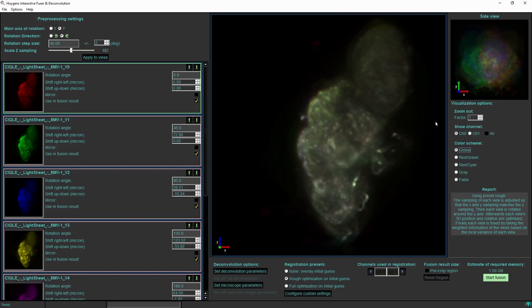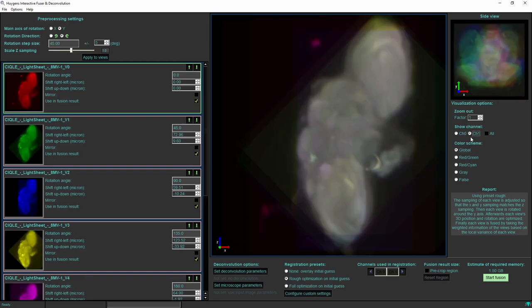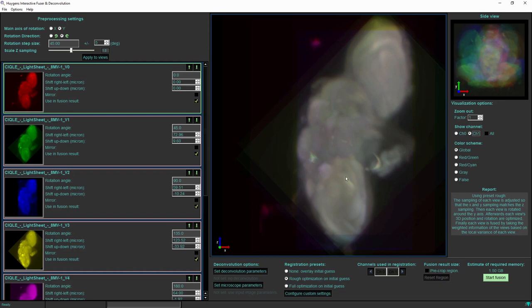I can also switch to the other input channel and now for the second channel, all of the eight input views have their own color. I can see in the overlay that the eight views are at least approximately aligned with each other, so I am happy with that overlay so far.